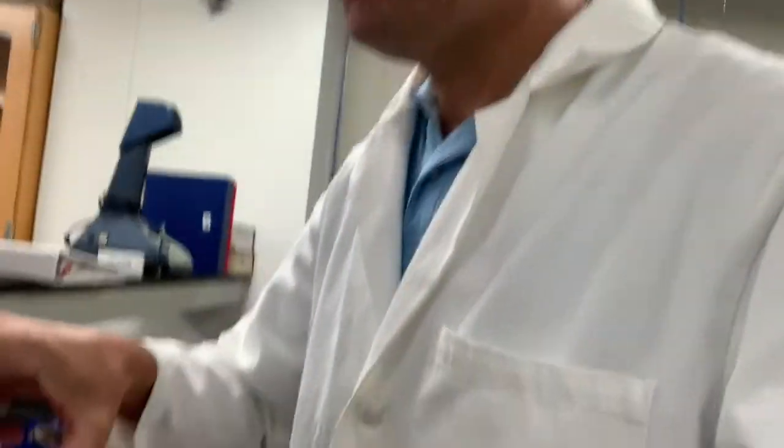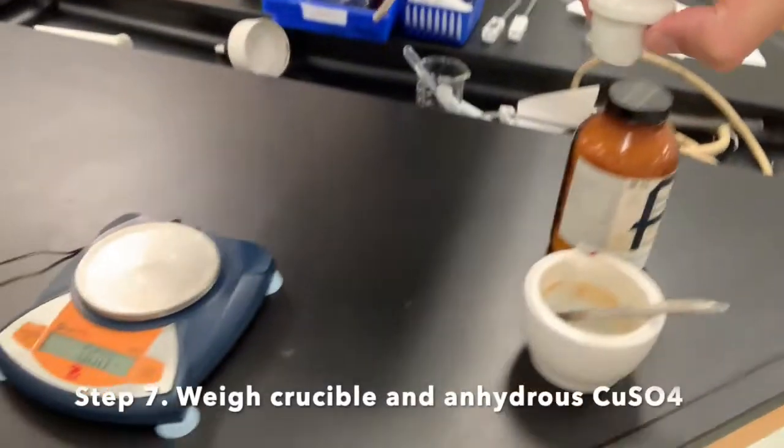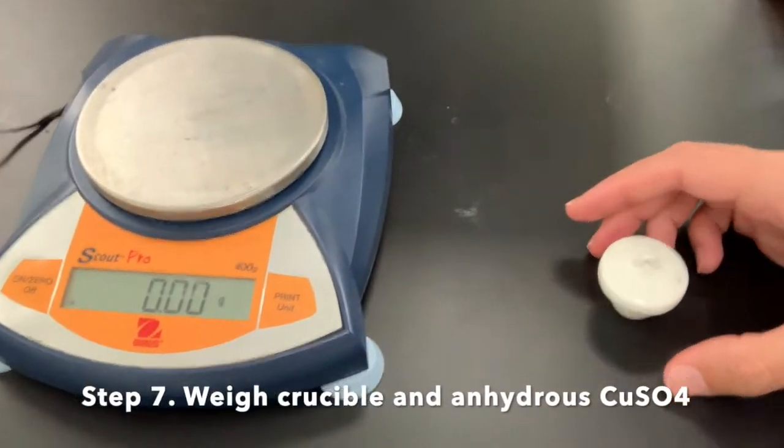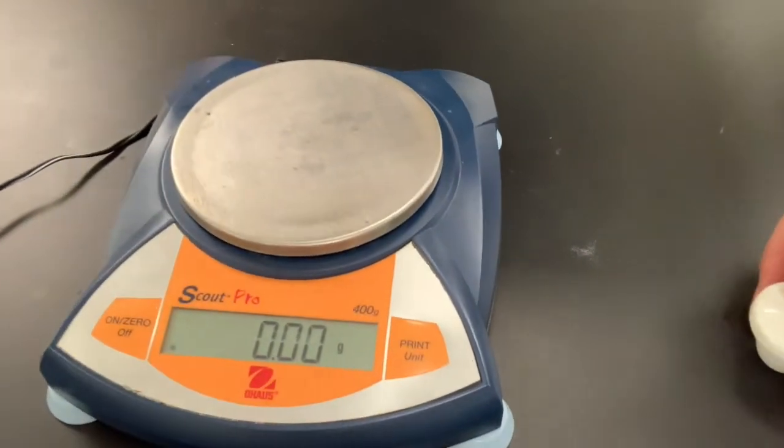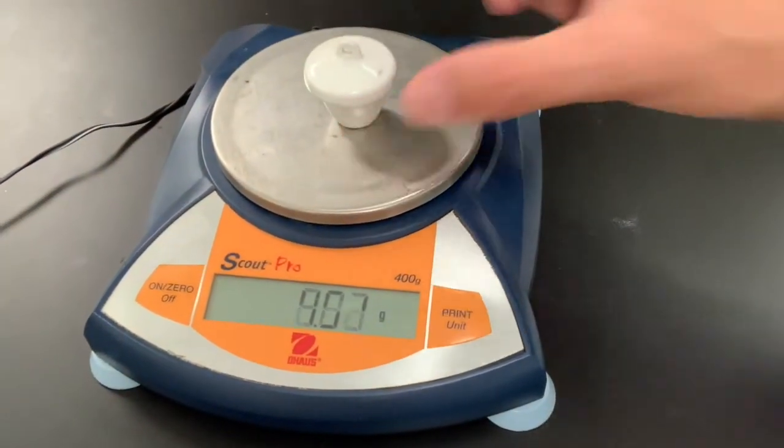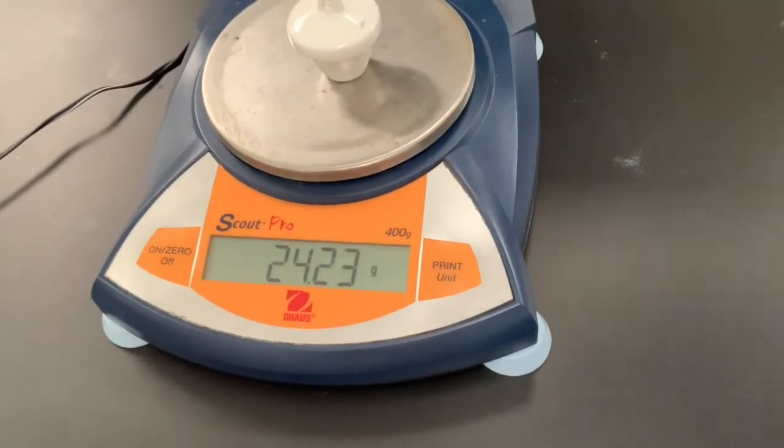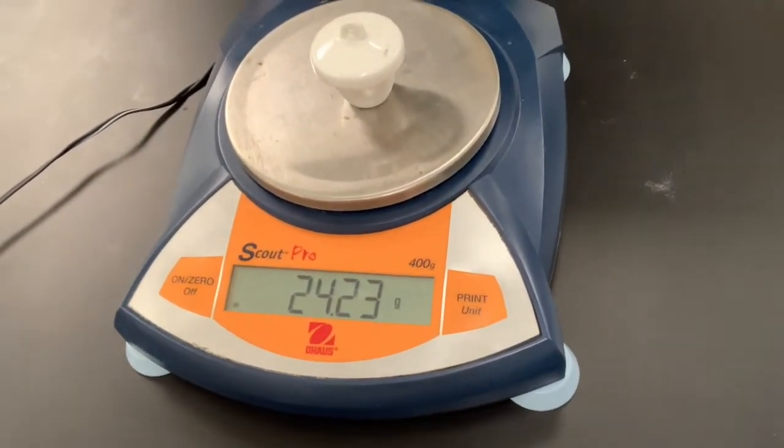We've been cooling this crucible for about 10 minutes and it's cool to the touch now. We'll come over here to the balance and we'll weigh it. Your balance should read zero. If not, hit the zero or the tare button. And we'll go ahead and put that on there and take a reading there. And that's it. We're done with the lab. I'll take you through the calculations now.